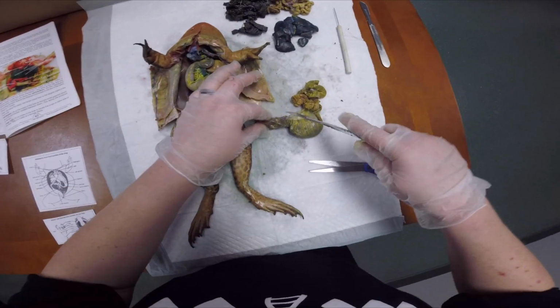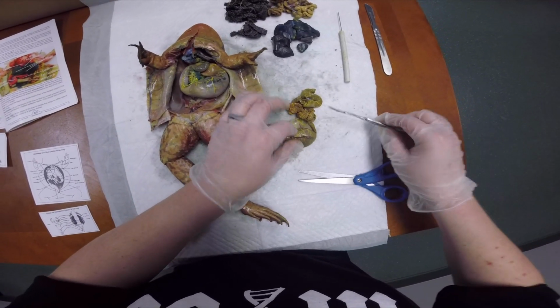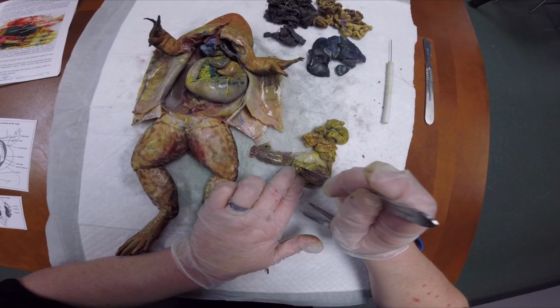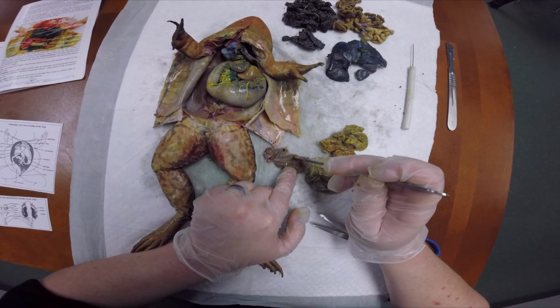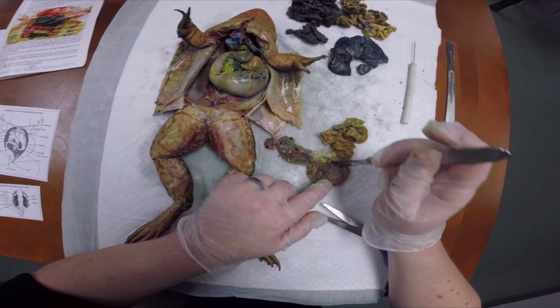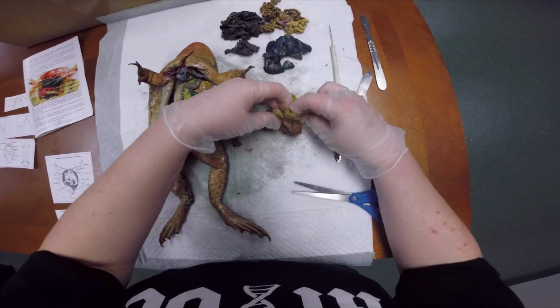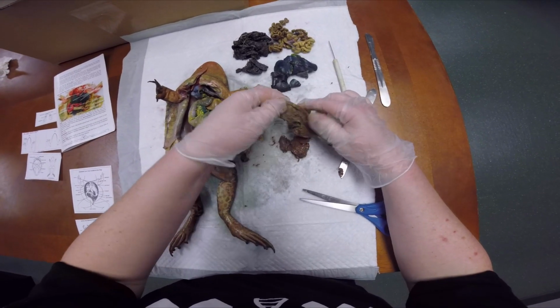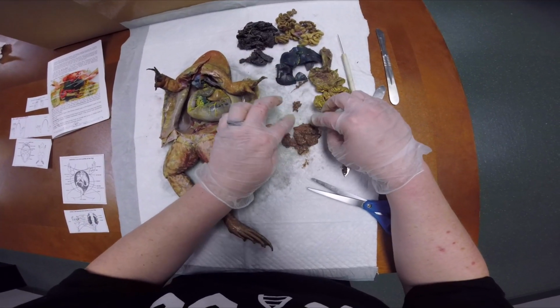So now let's open this up and see what he was working on. See what she was working on. Oh! Yuck! Whew, don't normally get large intestines like this with cool stuff in them. Oh, sick. All right, so you can see this one was working on digesting something red, probably a crawfish, or two, or three, or seven.